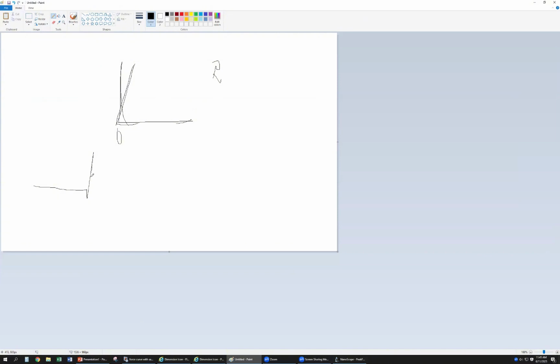one first curve we use the trigger force, this maximum point. So the trigger means you get this value. It doesn't matter where you are, you get this value. But for set point, this one is called trigger, no feedback. The set point is when you scan on your sample.